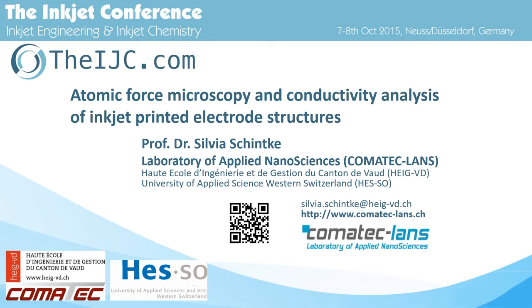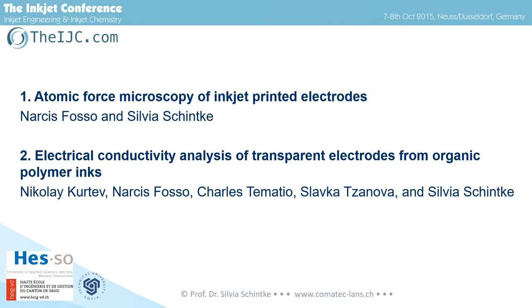So I will speak today about atomic force microscopy and conductivity analysis of inkjet-printed electrode structures. This is a topic which is mainly interesting for printing of electronics, but atomic force microscopy of inkjet-printed electrodes or structures can of course also be of interest for any kind of inkjet-printed patterns on surfaces.